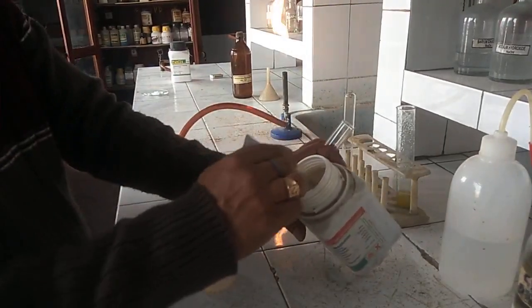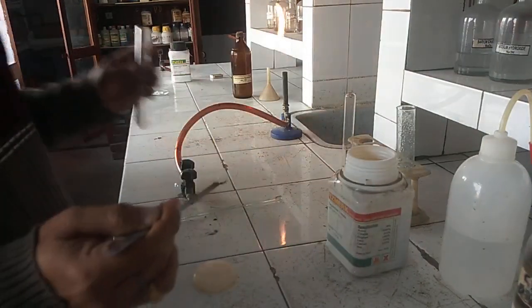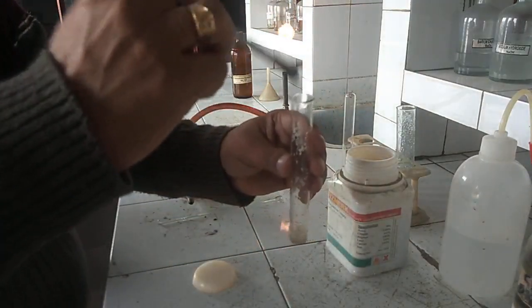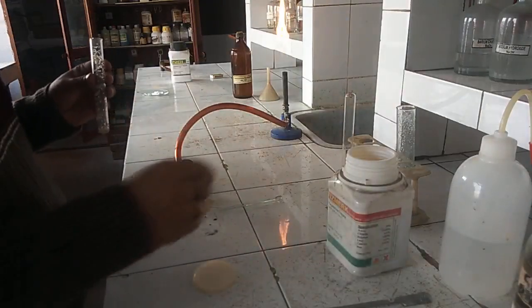The confirmatory test of nitrate is the ring test. For this test, we will take some salt in a test tube. We'll prepare an aqueous solution of it.